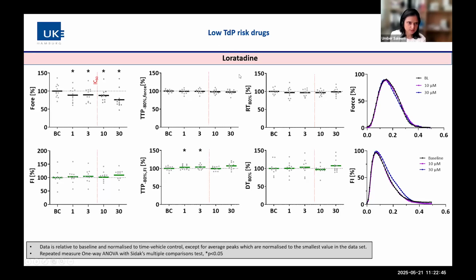And you can see loratadine decreased force, and it showed no effect on other parameters such as TTP80 for force, relaxation time, fluorescence intensity, and TTP80 for fluorescence intensity and decay time. And similarly, you can see in the average peaks for force and fluorescence intensity, a bit of tendency for the prolongation. So this compound adheres well to its classification into the low TDP risk category.